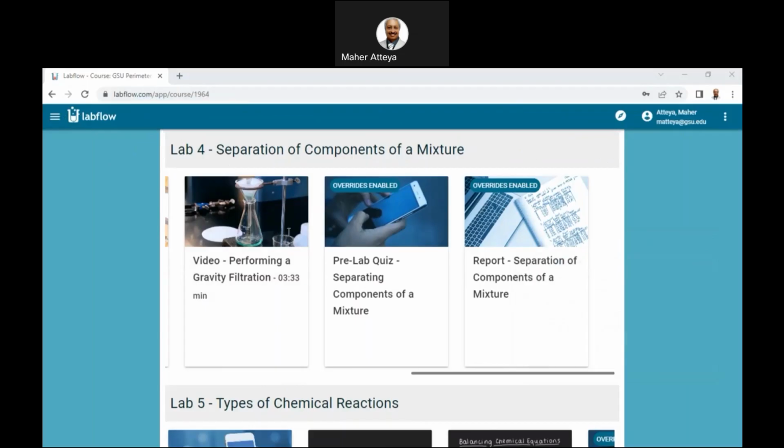So let me take a snapshot of this. Again, new, and sorry, it's not meant, but let me take another snapshot of the whole thing here.